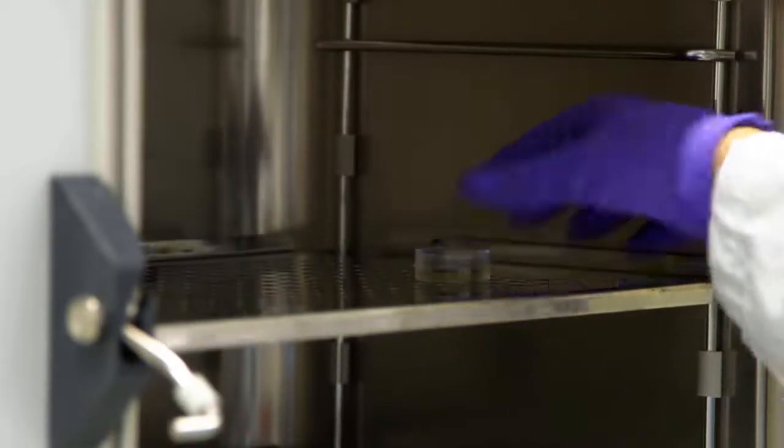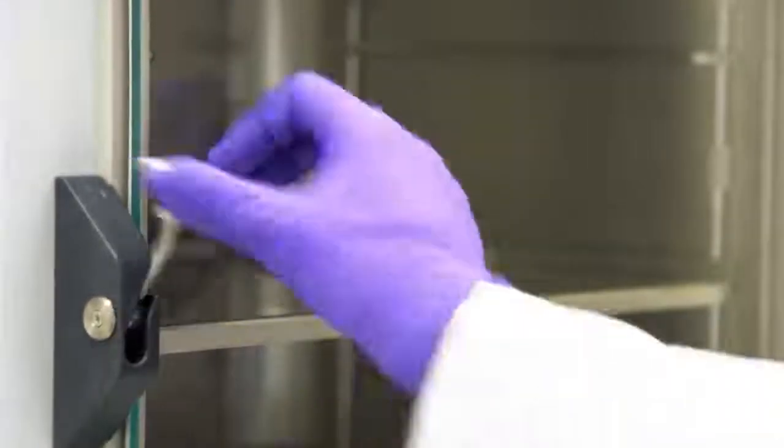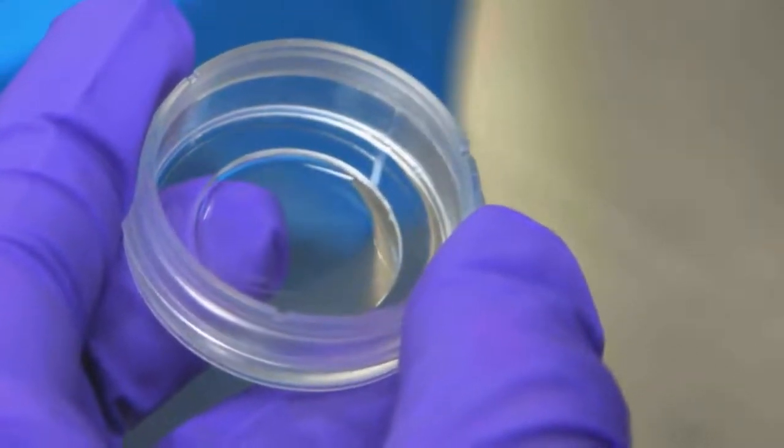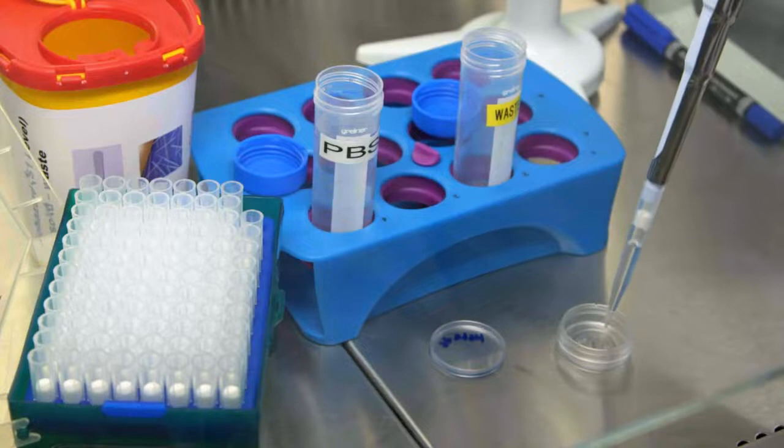After 30 minutes at 37 degrees Celsius and 5% carbon dioxide, carefully aspirate the dye-containing supernatant from each 35mm Petri dish and wash the cells with 2 milliliters of PBS.